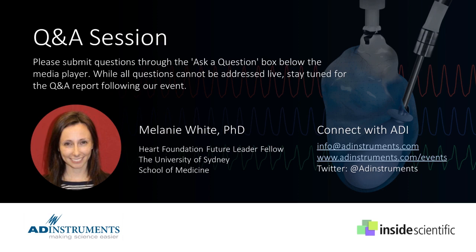So when we think of flow rates, obviously we have our flow rate into the heart and we have our flow rate out of the heart, and they won't be matched. And that's part of the improvement that was made on Oscar Langendorff's original Langendorff setup, that they weren't necessarily looking at the effluent flow rate. They were only looking at the afferent flow rate. So as far as the system is concerned, if you're developing a system pressure or a perfusion pressure of 70 millimeters of mercury, you've got a closed system. You're probably going to be perfusing both of those coronaries, and I'd be happy with that.